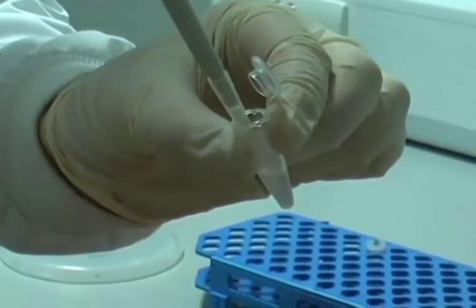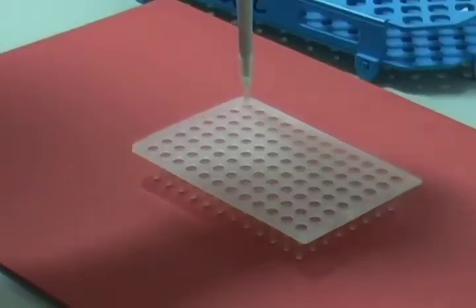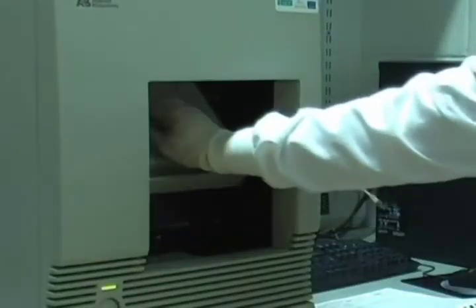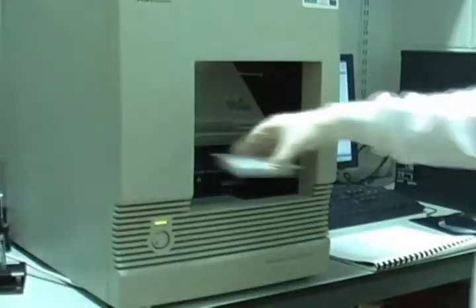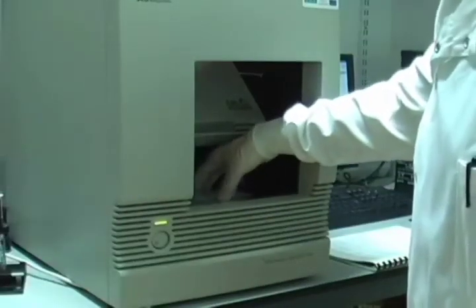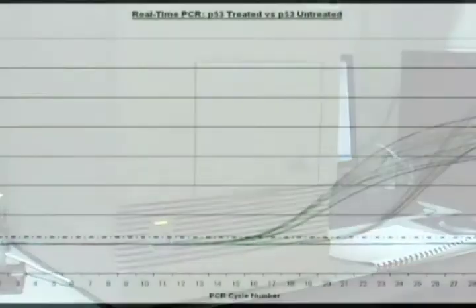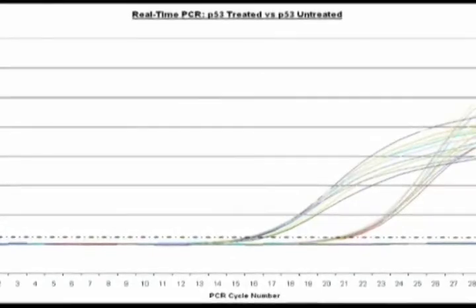After cDNA has been made, a PCR mix containing SYBR Green and the cDNA is added to a 96-well PCR plate. The plate is placed in the real-time PCR machine and subjected to 40 amplification cycles with fluorescence detected at each cycle. The cycle at which the fluorescence reaches the threshold value determines the amount of starting material and thus the degree to which the gene of interest is activated under the conditions examined.